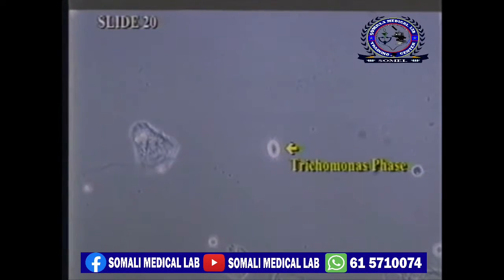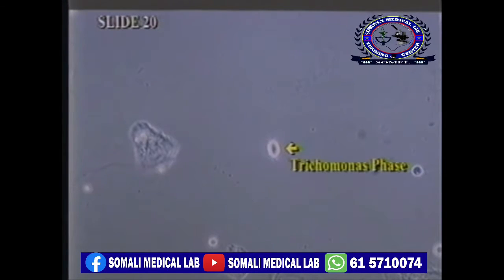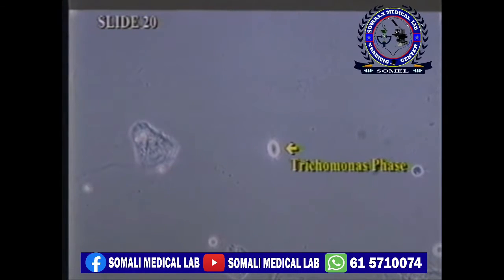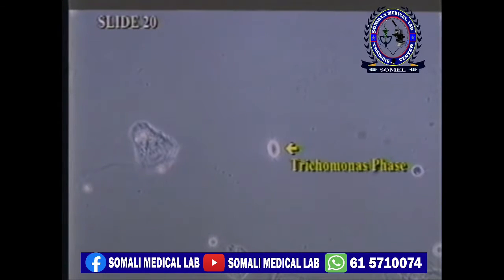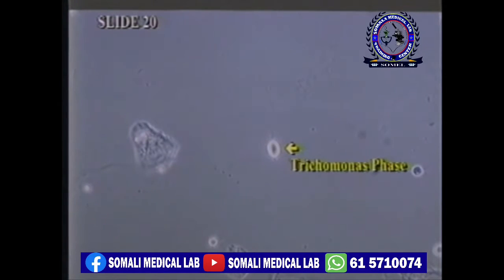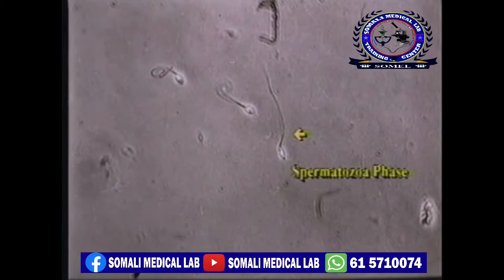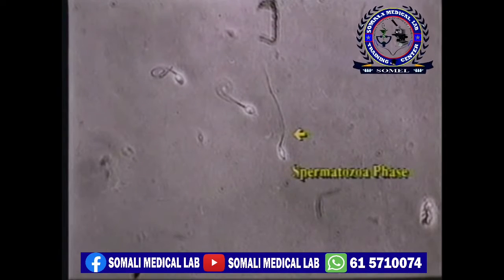Trichomonas, seen here under high power phase, can look very much like a white blood cell. Most of us, when suspicious, search until we find a motile flagella. Since these are not motile flagella, we will point them out. Or you can shake your TV screen. The last item we're showing you is sperm, which you see here under high power phase.